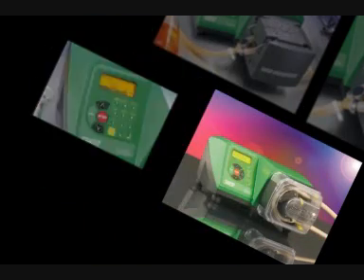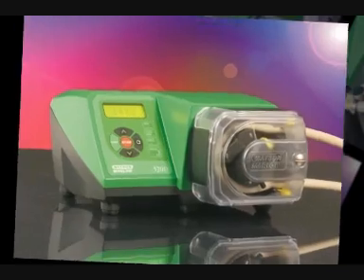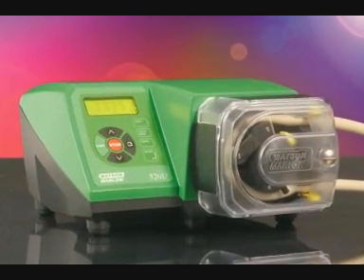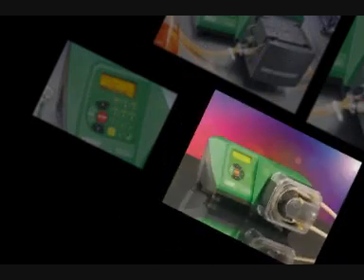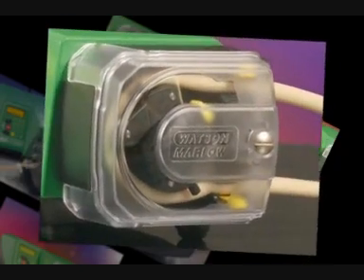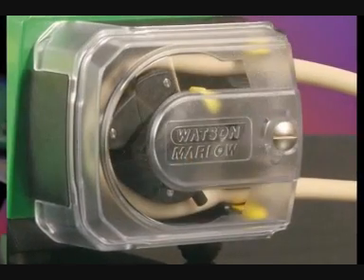All products within this range have a tough cast housing with sleek curved lines for liquid runoff and no bug traps. It also offers a smooth polyester finish which is durable, corrosion resistant and easy to clean. The model shown here is the 520U with remote auto and analogue control.